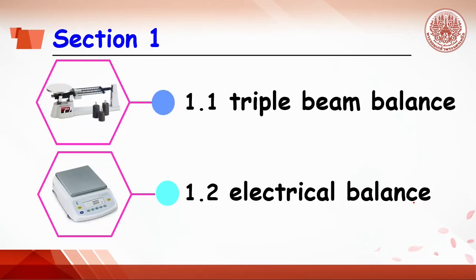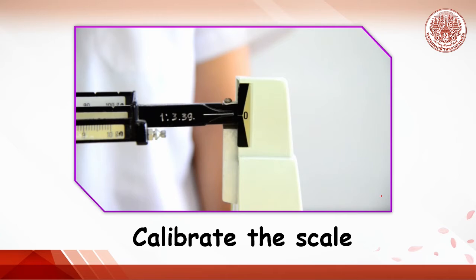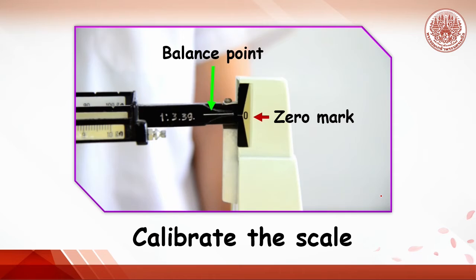Section 1: Weighing. Two types of balance will be used: the triple beam balance and the electrical balance. The object to be weighed is an aluminum cube. To use the triple beam balance, first calibrate the scale until the balance point is at the zero mark.